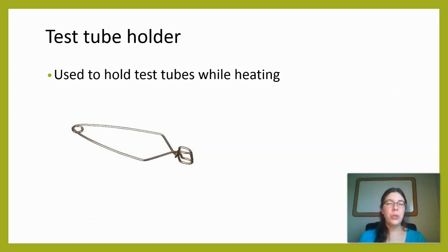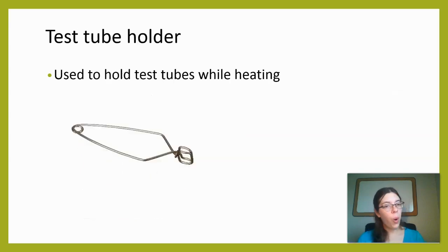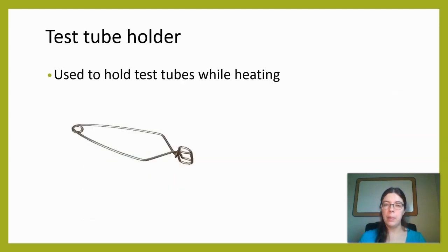And then we have the test tube holder. Okay, so notice, very similar names. We have the test tube rack and then the test tube holder. The test tube holder lets you hold a test tube while you're heating it. The test tube rack lets you store multiple test tubes upright when you're using them. So slightly different uses and purposes.